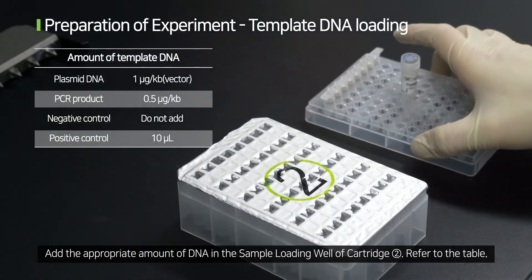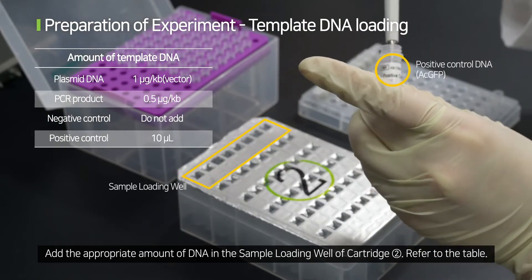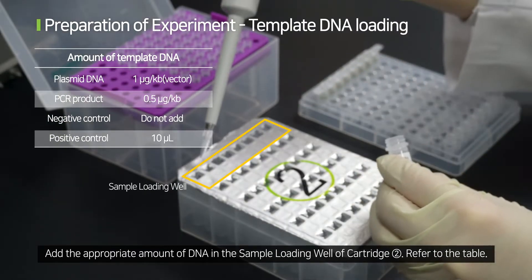Add the appropriate amount of DNA in the sample loading well of cartridge 2. Refer to the table.